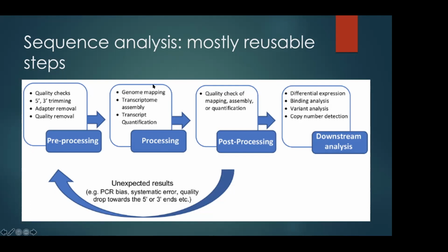And after you do these data processing steps, you get the tables. And there are also other steps here. Before processing, we had the quality checks on just the reads. But after processing, you also need post-processing quality checks. You need to do that too.